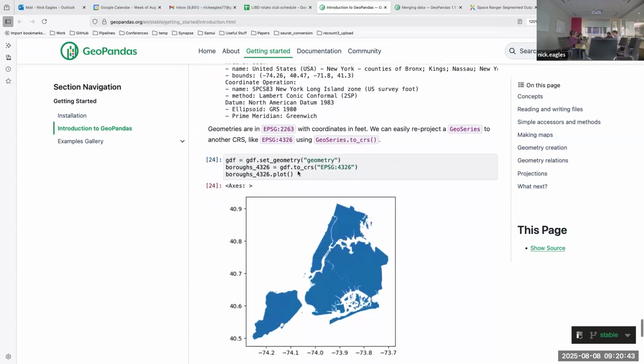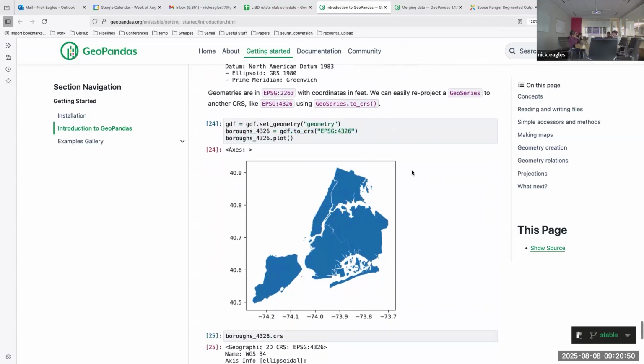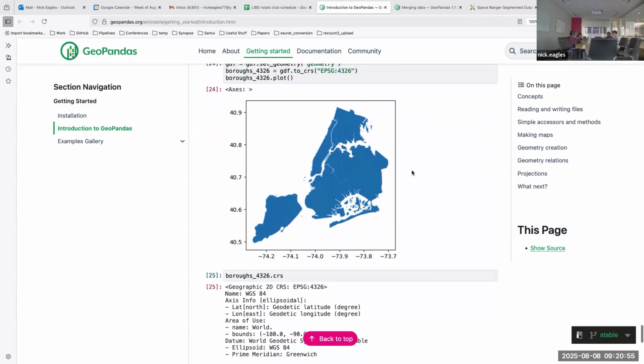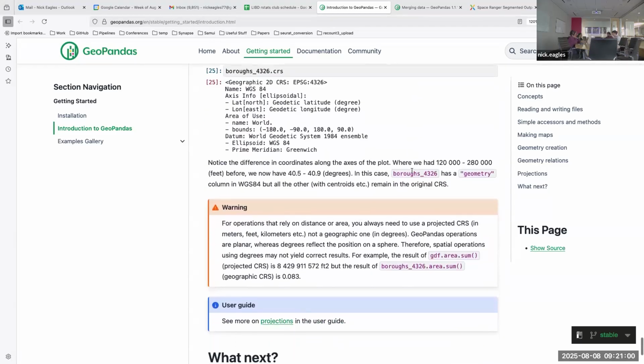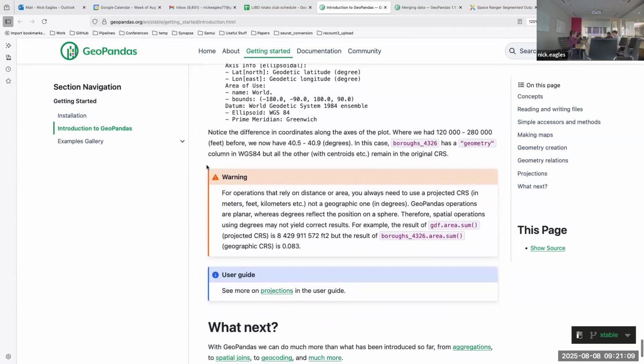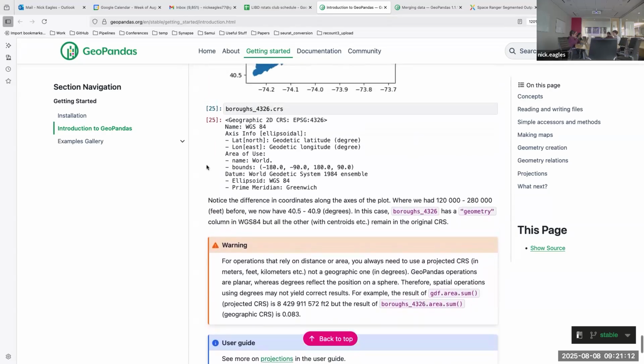You can set it to the geographic CRS, which when plotting is just going to look the same because you're not distorting any information like this. I think for spatial transcriptomics this is not super relevant, which is why I'm going quickly through it. But just keep in mind if you do use this library, make sure that your CRS is something like None. That's what I did for a problem I was working on. Or make sure it's not trying to use latitude and longitude, for example, which is not sensible for flat data.